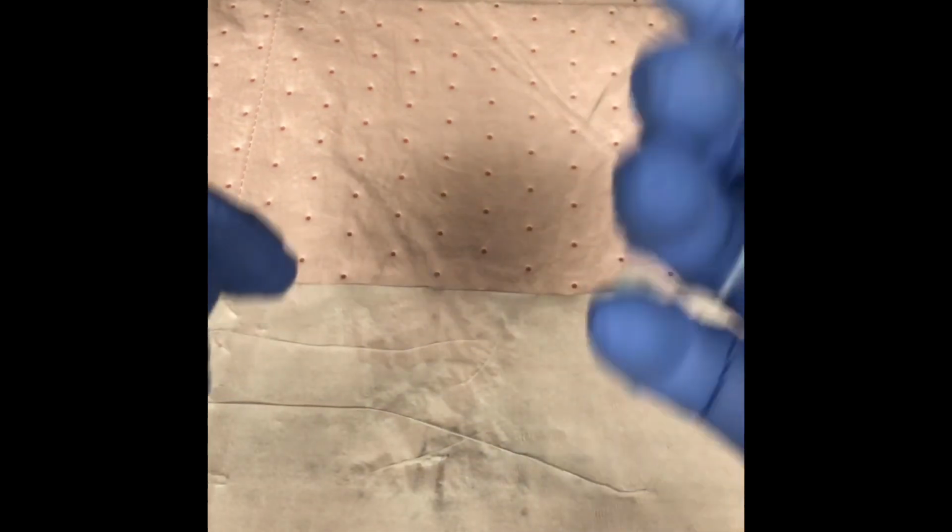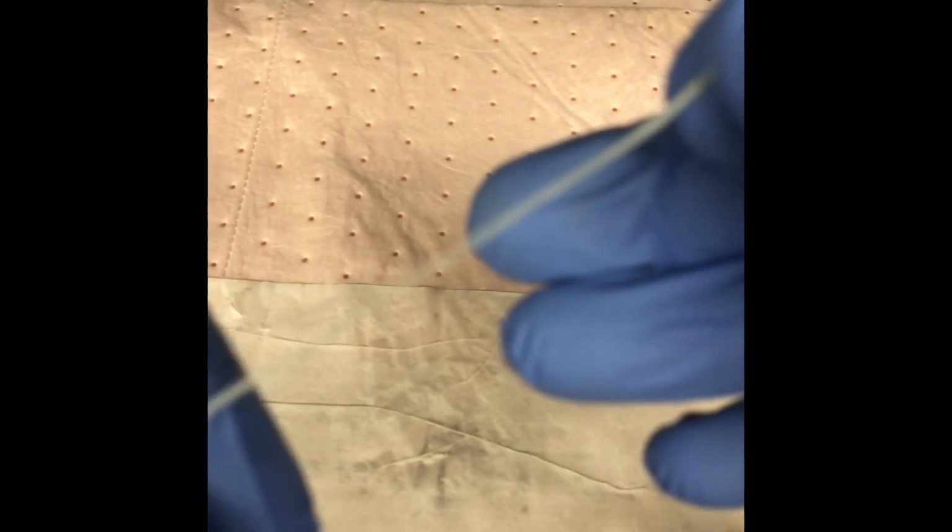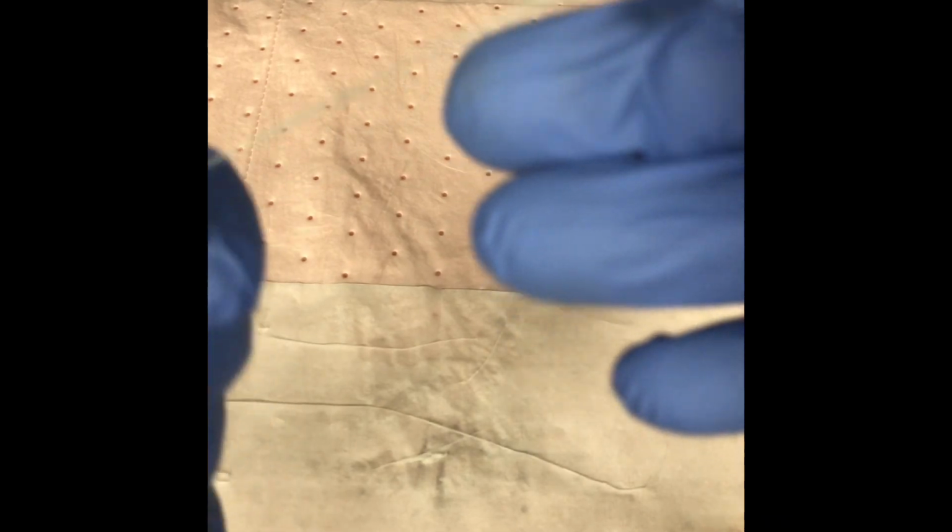Okay, everybody, it's been about 10 minutes. Now, this nylon has been drying, and I notice as it dries, it gets more able to withstand pressure. So this is a portion of a strand. I'm going to give it a little pull, and you can see, hopefully, it's starting to stretch, right? Let's get this focused on this nylon string.